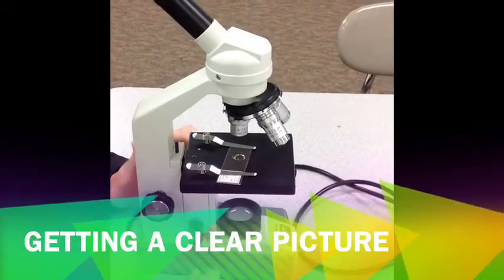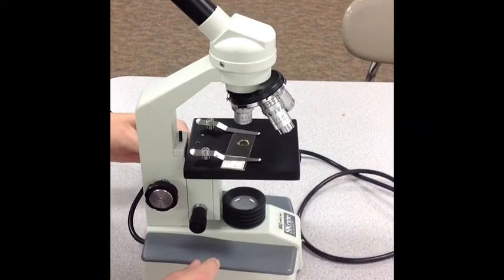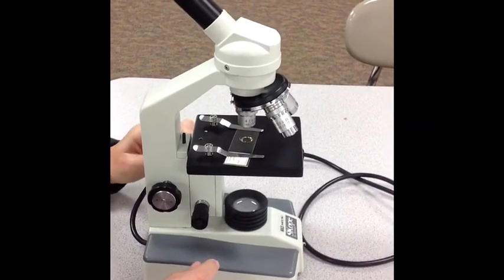When you get all this stuff set up, use the coarse adjustment knob to move the stage up closer to the objective lens.